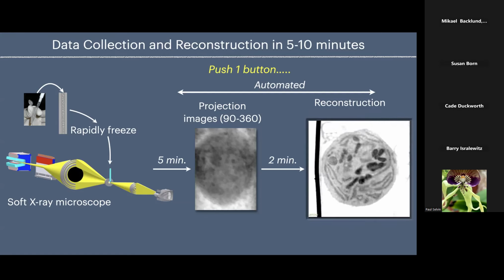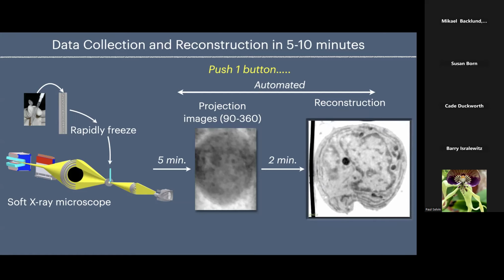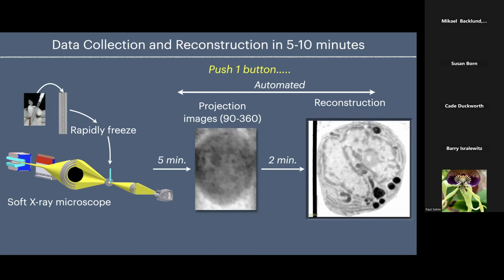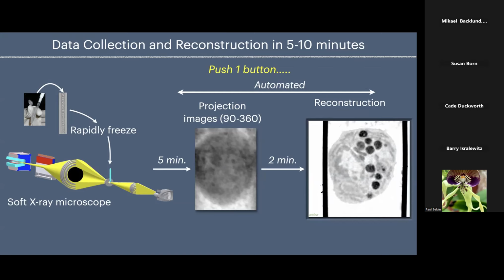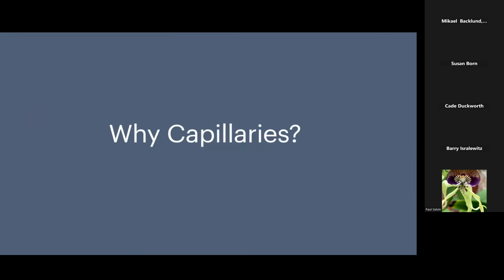Sure. Like with the yeast, when I asked you why there were more mitochondria in your bioarchive, you said it's because that has to be done by hand. Yeah, the others are automated. But here you can do the segmentation of the mitochondria? Yes, that's a qualifier I was going to tell you about. These are harder for some reason, but in human cells it's oftentimes easier. The problem there is you can see them, but they frequently contact other organelles, so you have to do some decision making, but it is much easier. So you can do a lot of stuff in a short period of time.